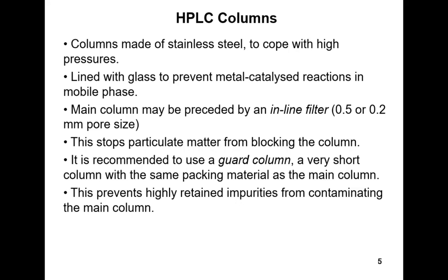It basically takes far too long for it to elute from the column, and it blocks binding sites. If there's enough material, it can close up the space between the stationary phase particles, making it harder to push the mobile phase through, building up too much pressure. I suspect that's what's going on with the system that we did the lab class on.